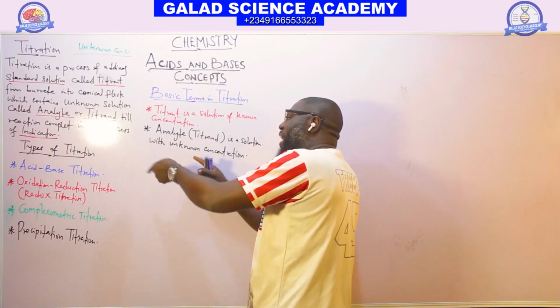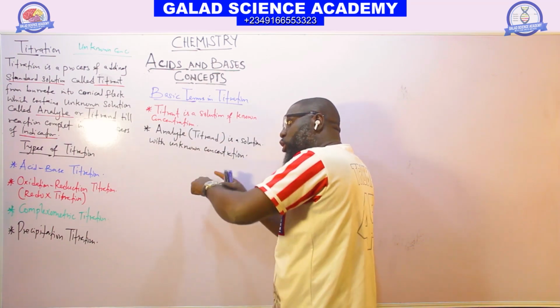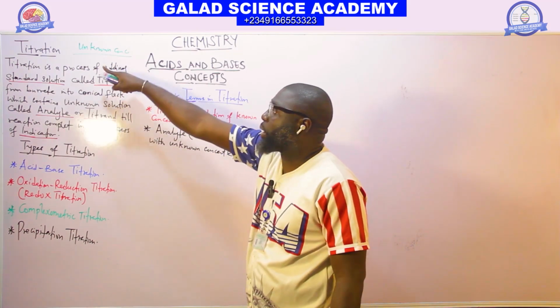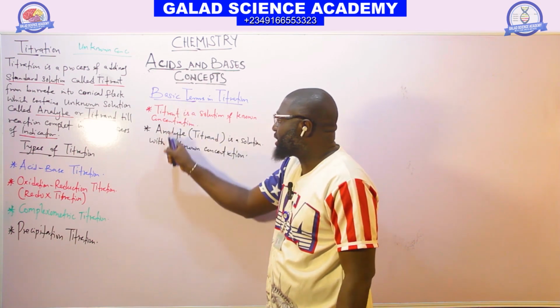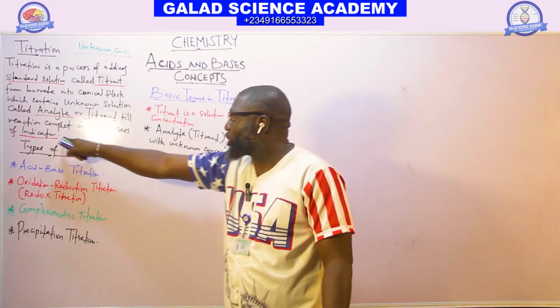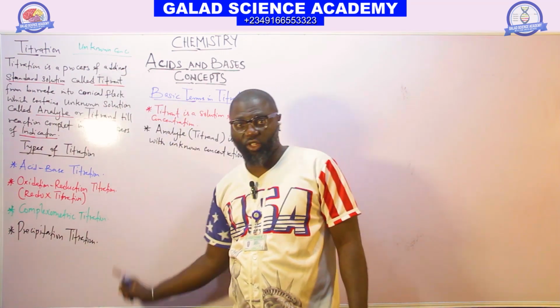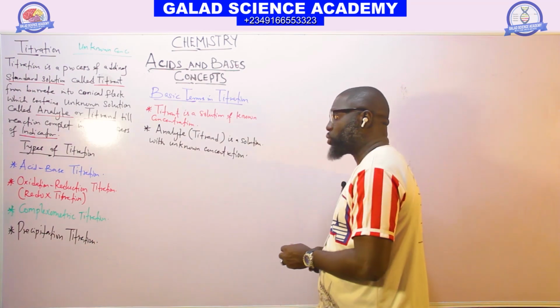The process of analyzing the unknown to get the concentration is called titration.